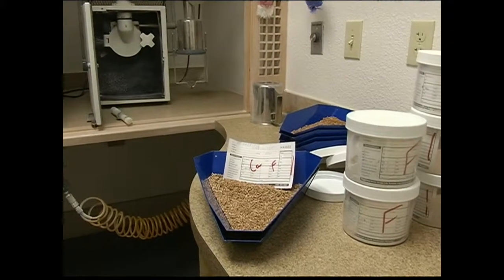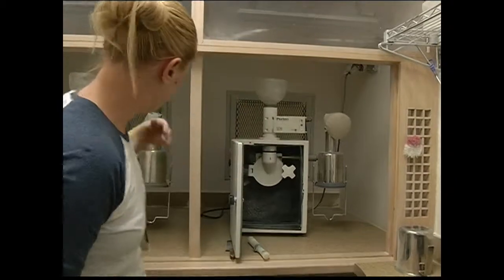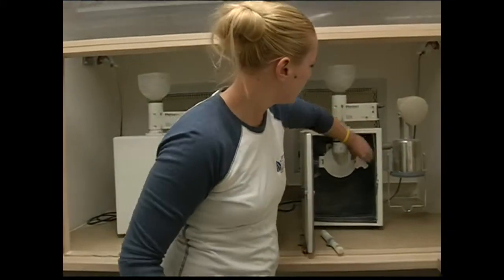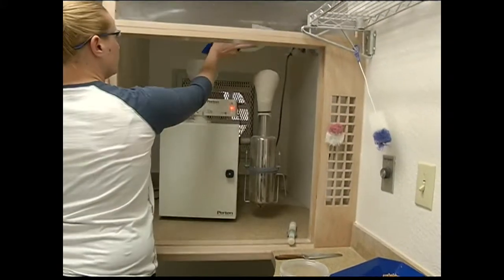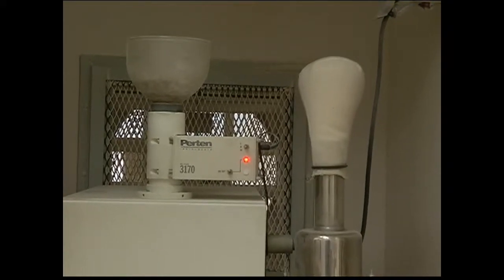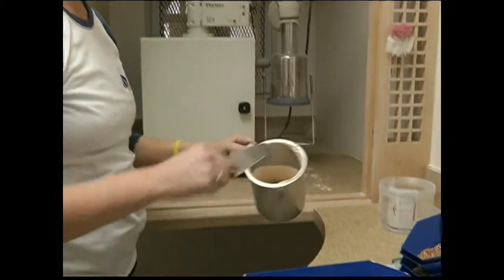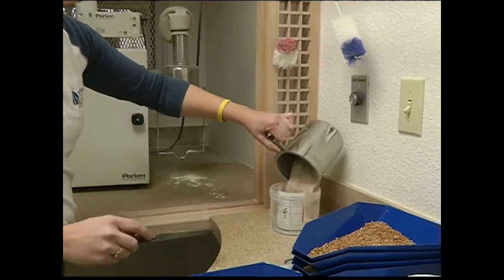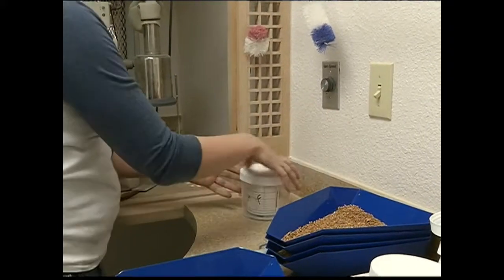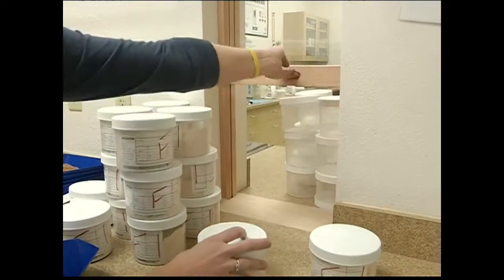We throw it into the grinder. This is our feed process here, so it goes into here, comes out through the bottom into a cup as it grinds from the inside here. So this system turns in here, so as it goes through, it grinds, comes through here, grinds over here, and then you mix it up, stir it up, put it into one of our little bottling systems, and then after it's ground up, just like so, and then you send her through.